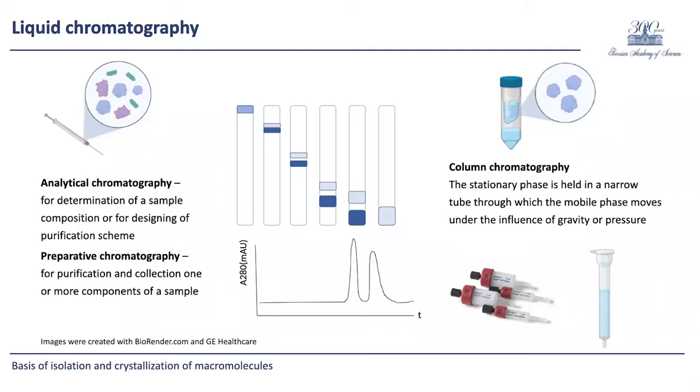Now we are starting the part devoted to protein purification. What is chromatography? Chromatography is a method of separation and analysis of mixtures of substances, as well as the study of physiochemical properties of substances. The word chromatography is from the Greek word chroma, color, and graphein, to write.